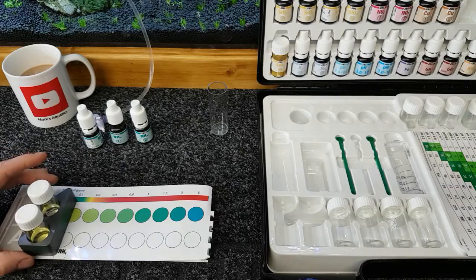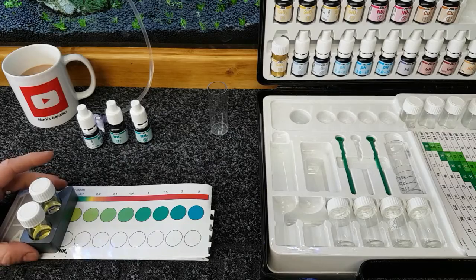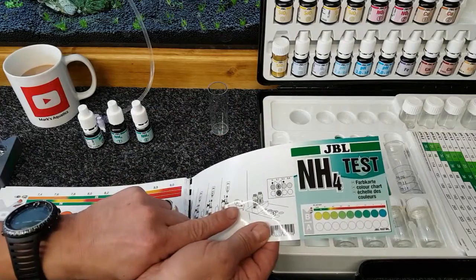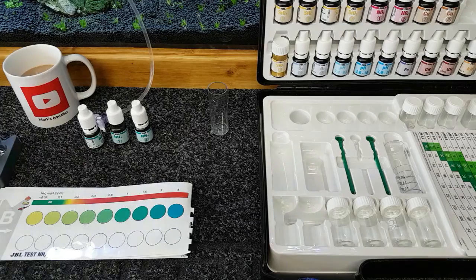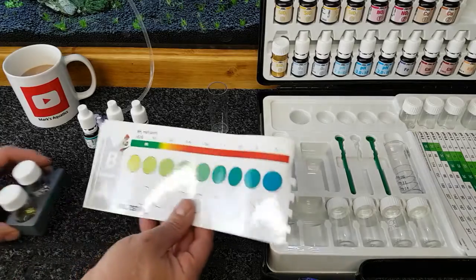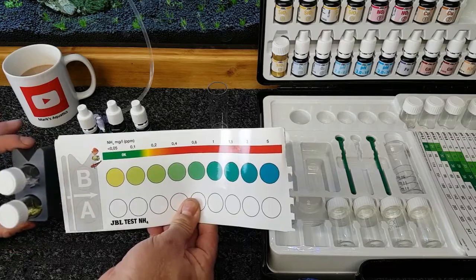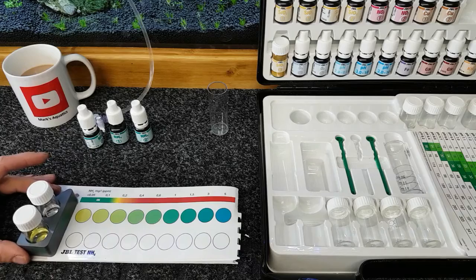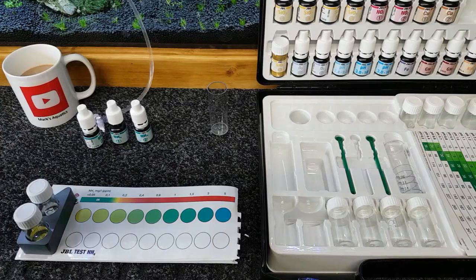Now, as soon as you've done that, time it now for 15 minutes. It says it on the edge of the test there with a little clock by it, 15 minutes. So time that on your watch, or set your alarm or your stopwatch. This is your indicator block here, and that's the way you want it to go, you see? That corresponds to that there. So you leave that on there for 15 minutes, and then we'll come back in 15 minutes and we'll go through the test, okay?